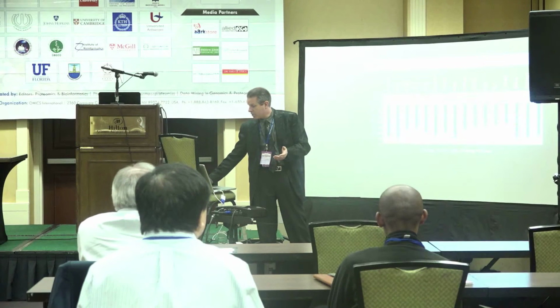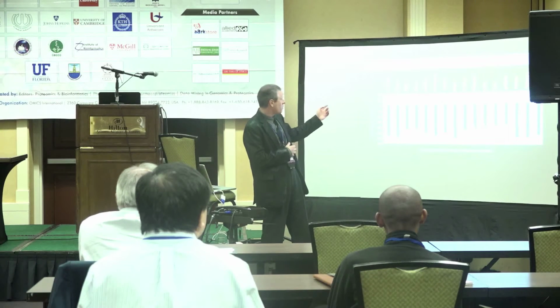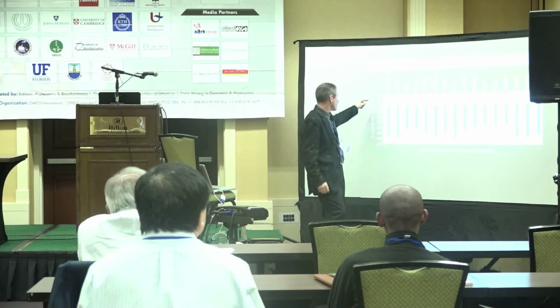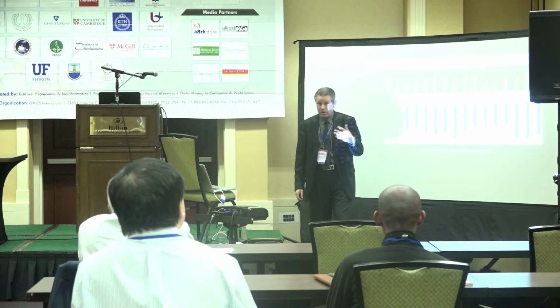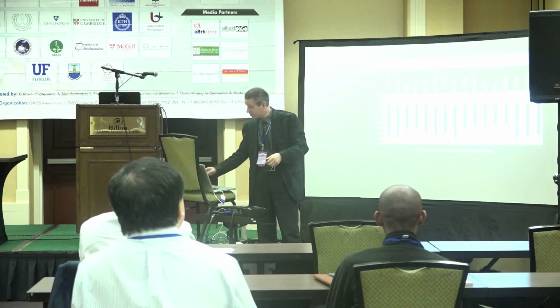And using that approach, we did try to take drugs on the microarray and look to see, with staurosporin, a very non-specific kinase inhibitor, whether you get reductions of signal. This is the percent change from the untreated sample at 2 different doses of staurosporin. So you can see that, yes, you can interfere with the binding of the FSBA probe with drugs.